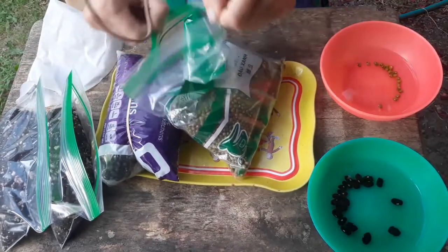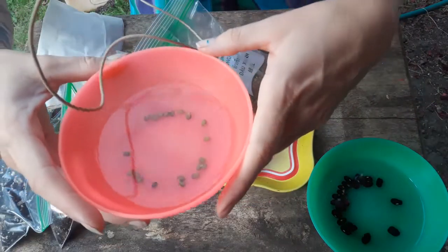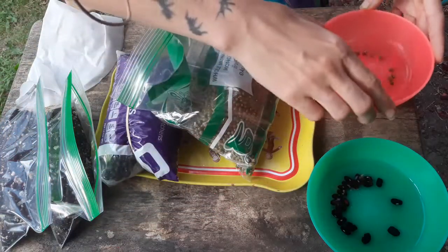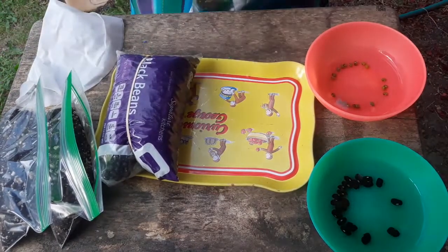I wanted to compare some of those to what they look like after they've been soaking in water for about half an hour. They tend to swell up a little bit in size — not super noticeably, but if you weighed them before and after you would see that there was quite a bit of moisture that they gained.